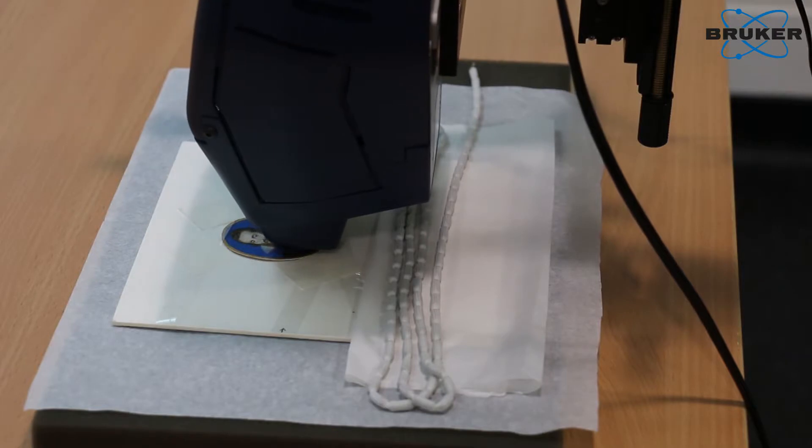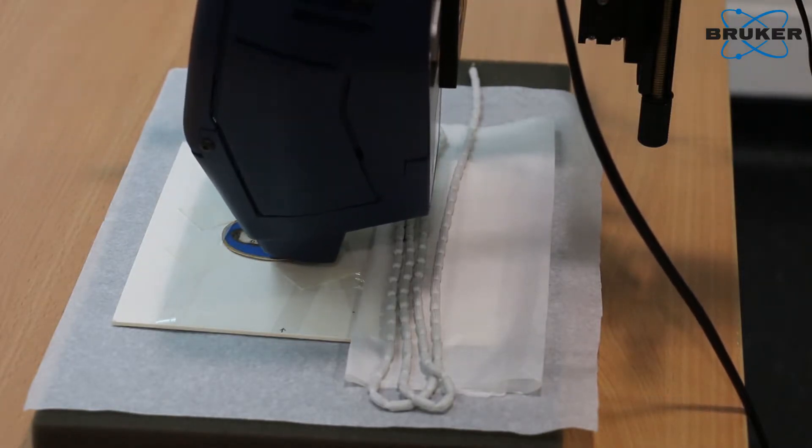One of the beautiful things about X-ray fluorescence is that it does not only give us surface information, because the X-rays penetrate through the paint layers all the way down to the parchment. So we can get information about the whole stratigraphy of the object we're looking at — from the parchment substrate all the way up to the upper paint layers, which might often be retouches made in the 19th century.